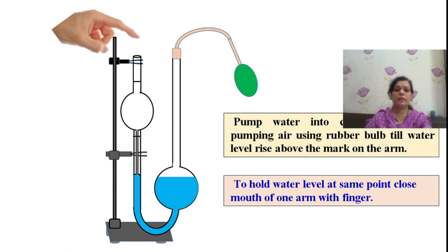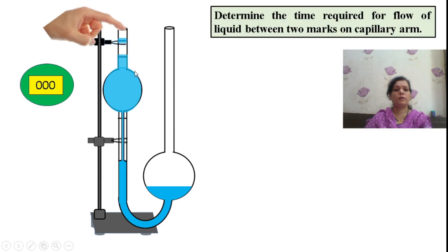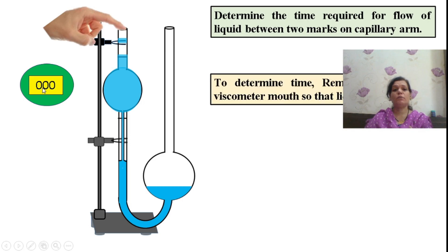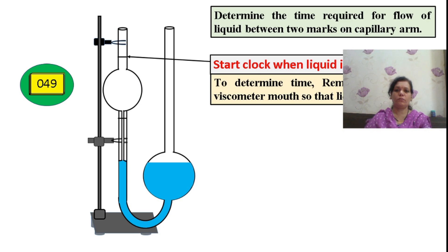When we are pumping the air, liquid will move ahead and move up to the top. You have to utilize your finger to hold the liquid layer at the top. Keep your watch clock ready and when liquid is coming up to this X mark, hold that liquid up to that particular mark. Then release the pressure by removing the finger, keep your watch ready and measure the time of flow from X to Y. This is your time of flow for water.